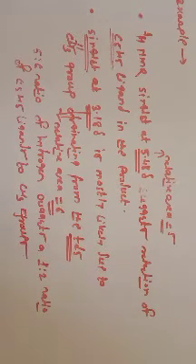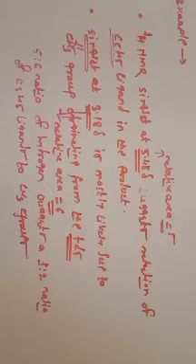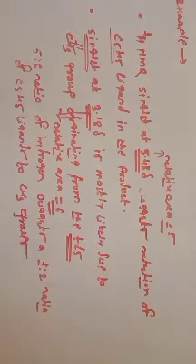We are very much familiar that whenever a pi cyclic system is there, it gives a chemical shift value between 4 to 7 ppm, as we already discussed. Whenever there is eta 5 C5H5 or eta 6 C6H6, the chemical shift is 4 to 7 ppm. So 5.48 indicates the presence of C5H5 ligands in the product, and the singlet at 3.18 indicates the methyl group present in the product, originating from the TDS. This much information we get from the H1 NMR spectra.